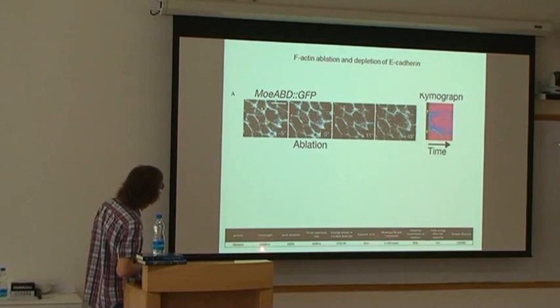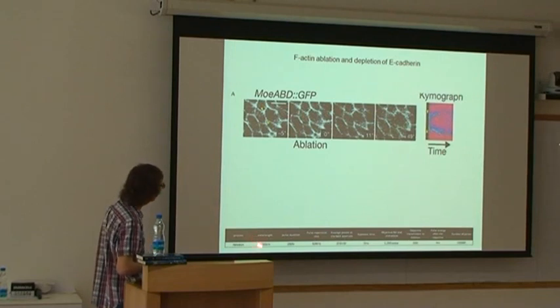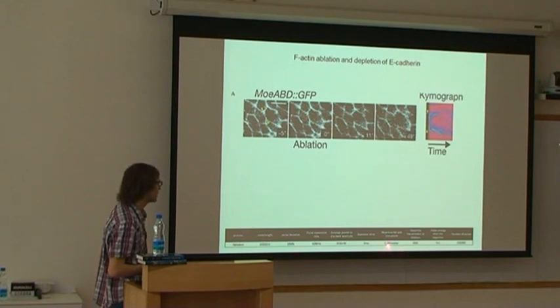So again, what is it? Is it an infrared laser? In fact, it's a neodymium YAG solid-state laser. Again, it's a femtosecond laser. And this is the kind of objective that I was using at the time, water immersed. This is the pulse energy.